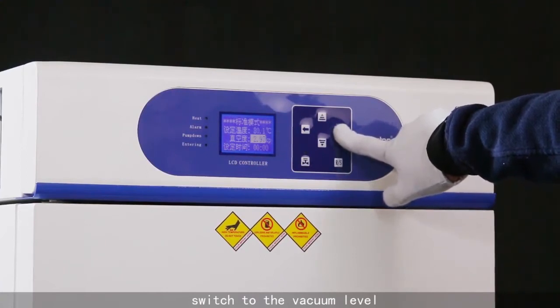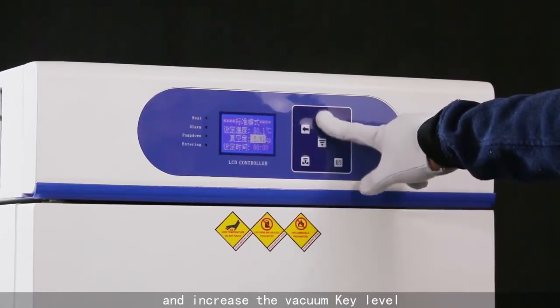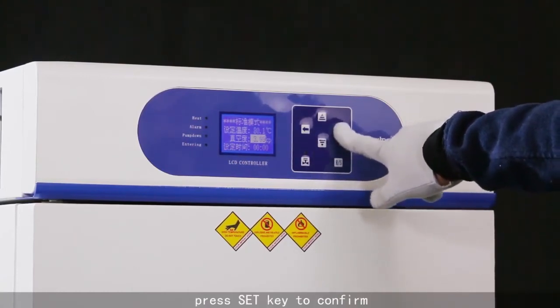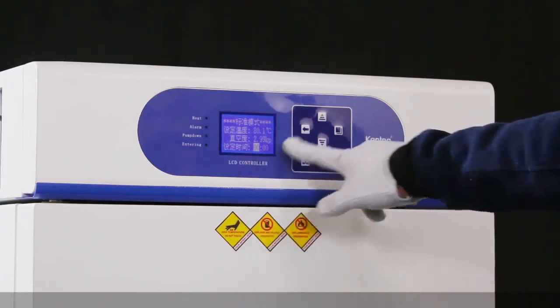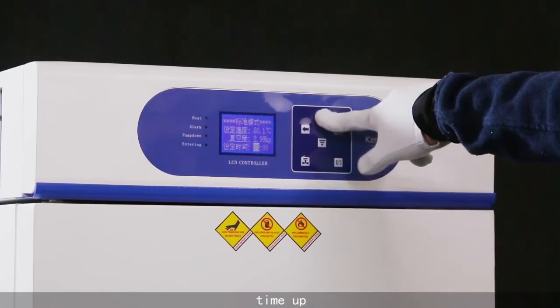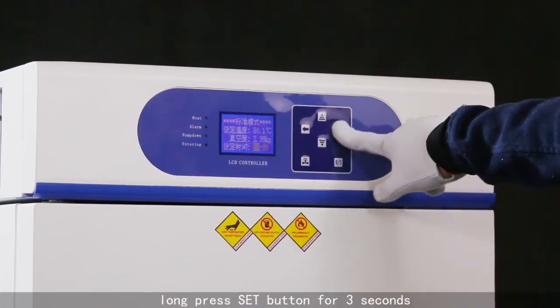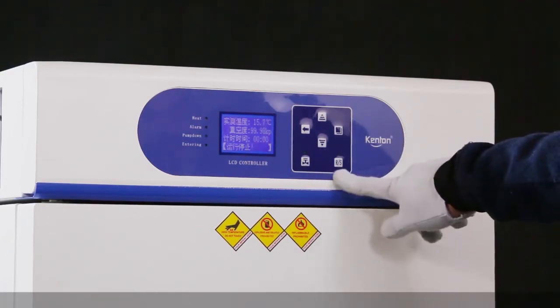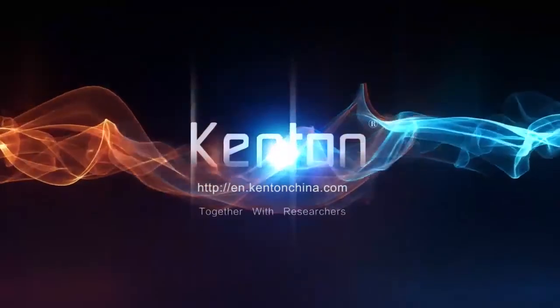Switch to vacuum level and use the increase vacuum key or vacuum degree down key. Press set key to confirm. Switch to timing: use time up or time down. Long press set button for 3 seconds, then press start button for 3 seconds. The machine runs.